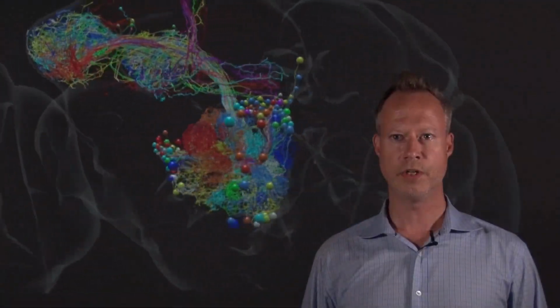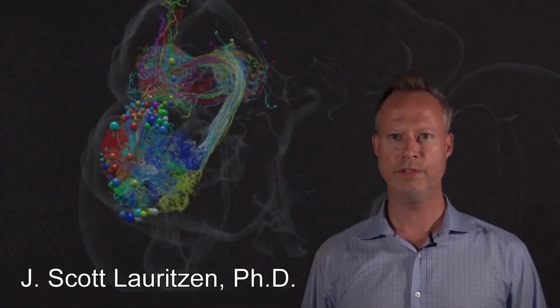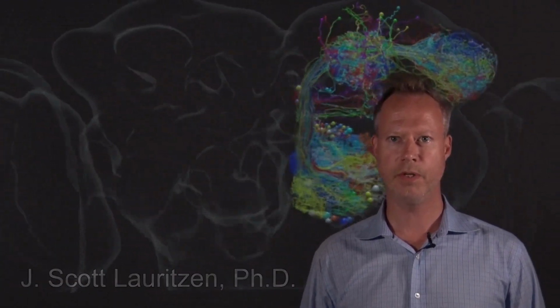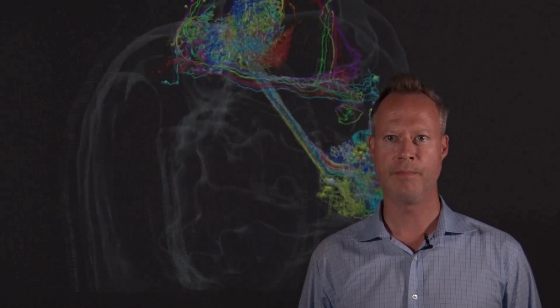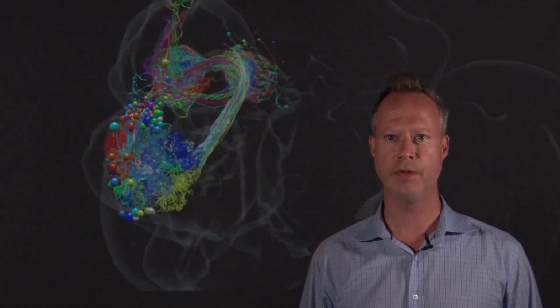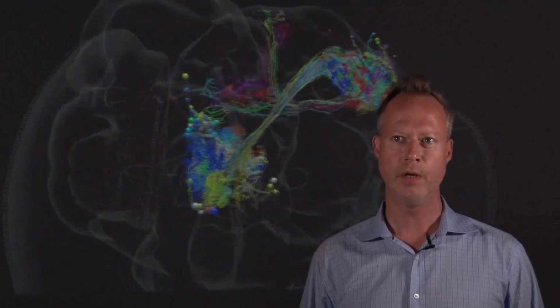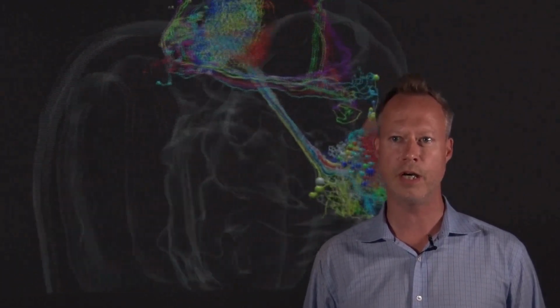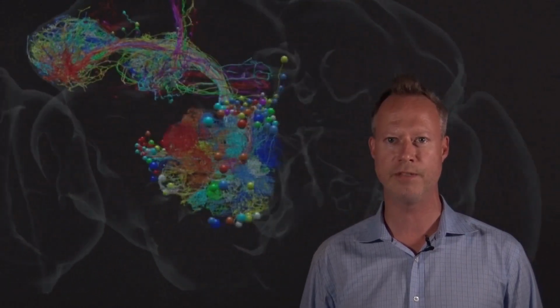The principal neurons of the mushroom body are called Kenyon cells, which receive dendritic inputs from projection neurons. Most of these inputs are thought to be olfactory, but it was not previously possible to map them all. In addition to their inputs, Kenyon cell dendrites also make output synapses, but their postsynaptic partners were unknown. We took advantage of the synaptic resolution in this whole brain volume to identify the partners up and downstream of Kenyon cell dendrites.